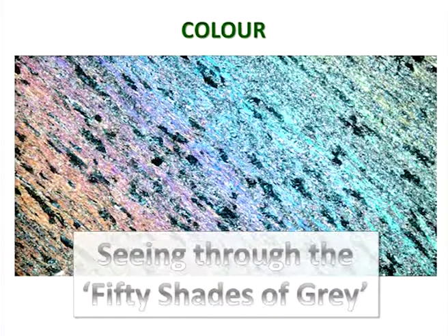So yes, we're talking about colour, and the first thing we've covered is actually quite important: we're looking at those opaque minerals. A mineral that is black in plain polarized light is opaque, essentially not letting any of the polarized light through at all. Those minerals tend to be oxides or sulfides, things like iron oxide and iron pyrite, for example, and they're usually minor components of rocks, but it's worth noting them.